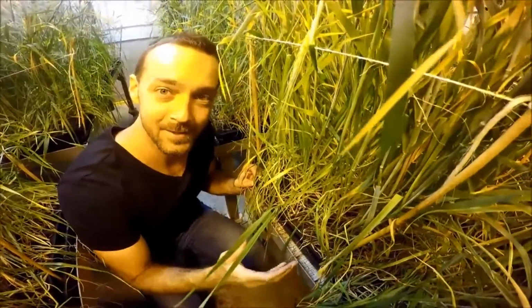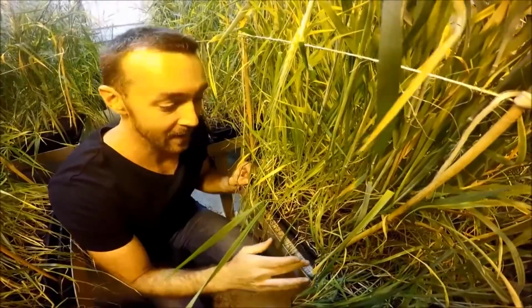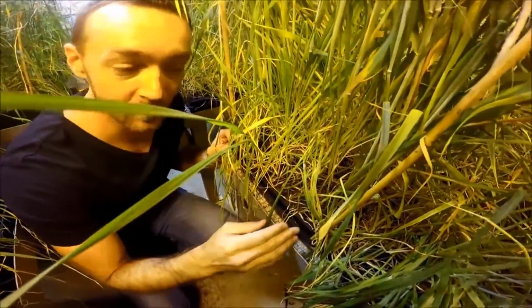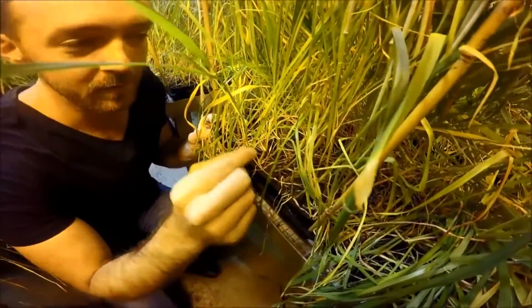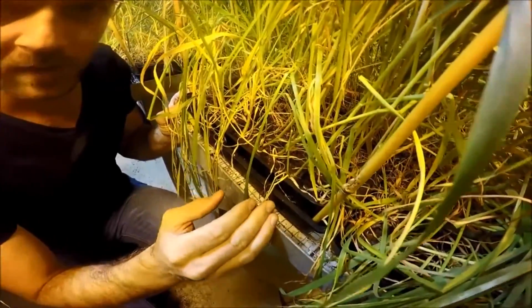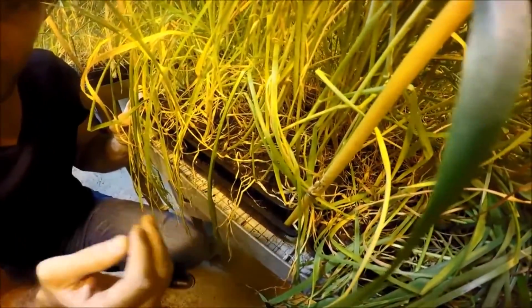We're growing these plants in 100 cell trays. Now, it's 10 by 10 cells, and you can see when we grow them in this system, they generally produce one spike, one tiller each, and that's enough for the purpose, particularly for a single seed descent when we only want one seed.